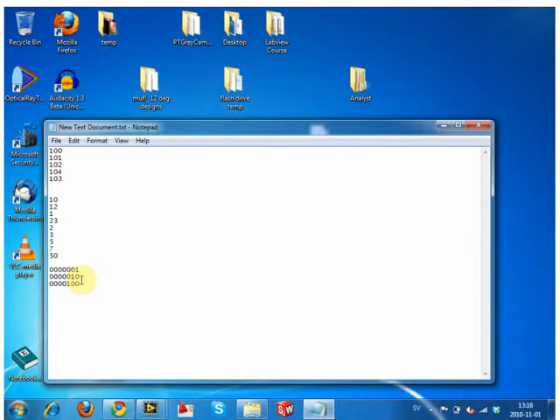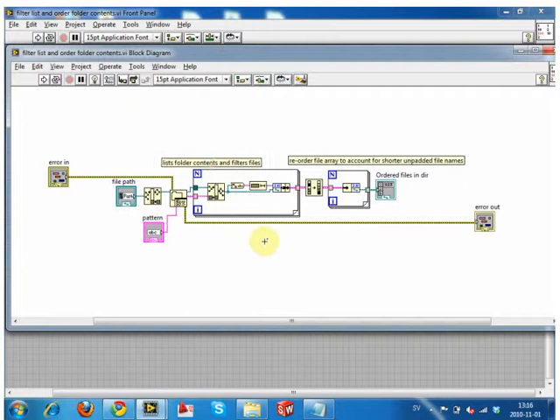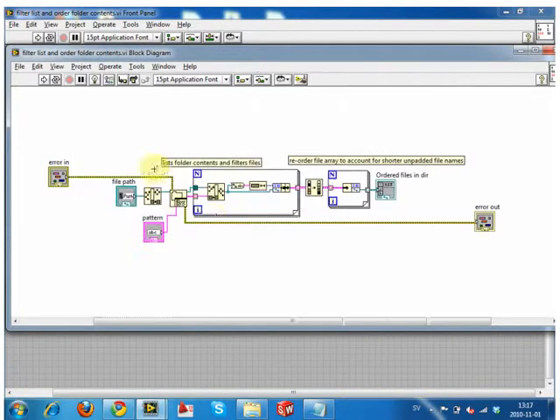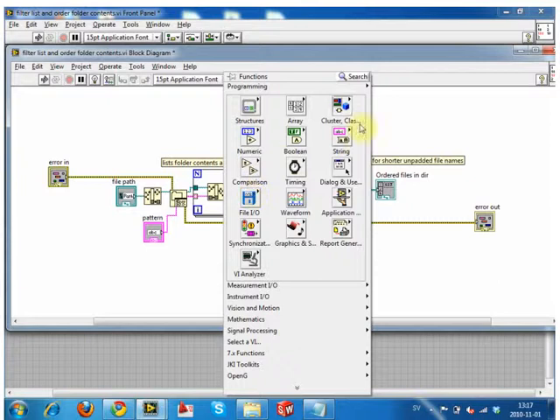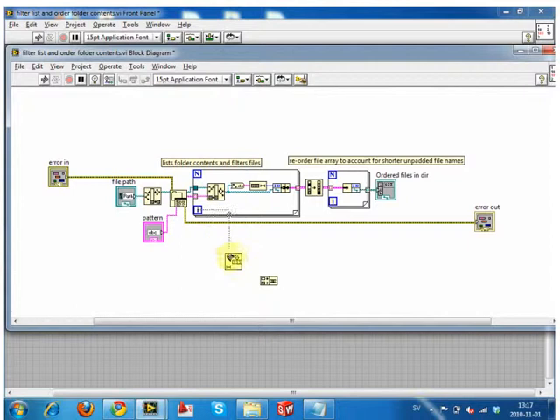Essentially, you make a little script. If I show you on the block diagram what it does, you have something which adds things to a string. This is called concatenating a string. Then rather than just wiring up the I value to increment the name, we run the I value into the bottom one. Because this is a string, we have to convert it from a number to a string first. We would do this inside a loop.